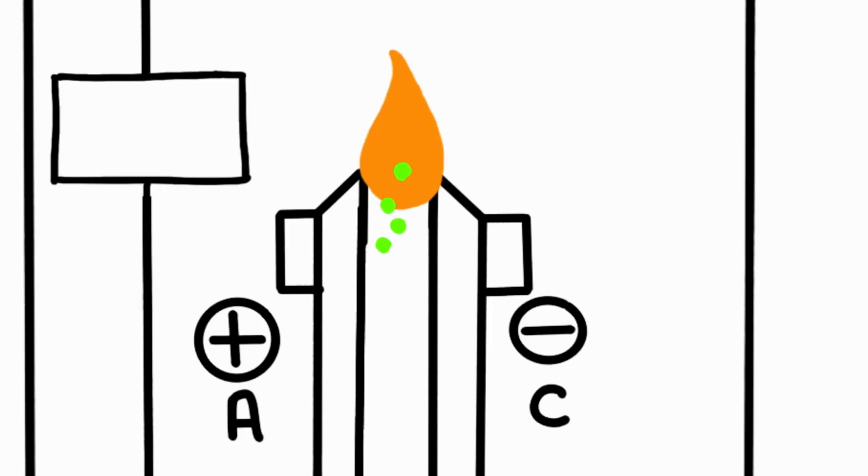The analyte and carrier gas enter, carrier gas leaves, analyte gets combusted, it splits into two ions, and these ions arrange themselves as per the charge they possess. This basically forms a bridge for completion of the circuit.